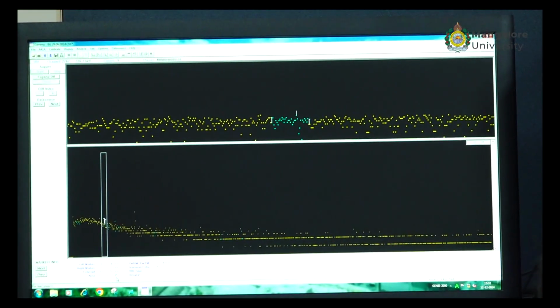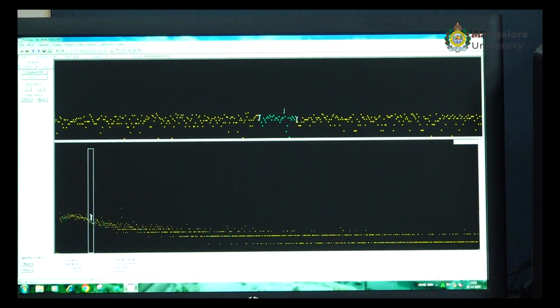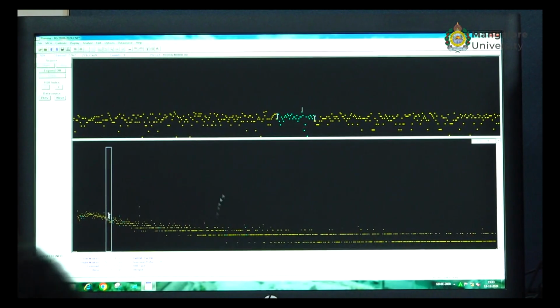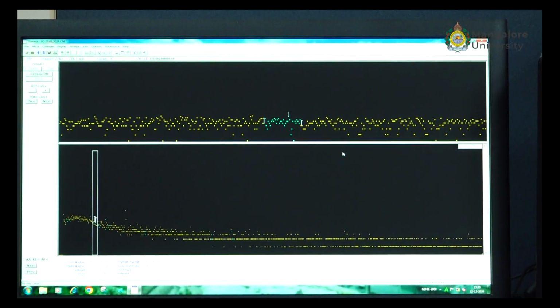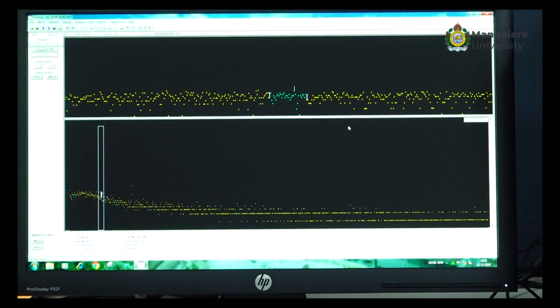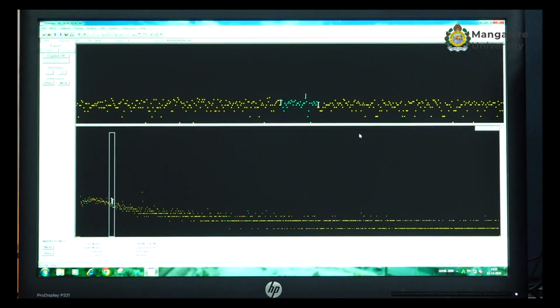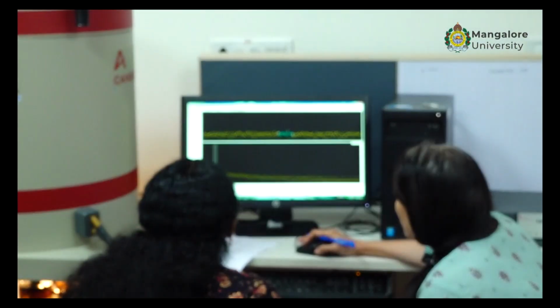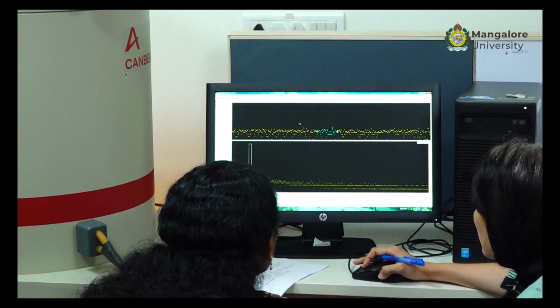No need actually, because first of all the counting time itself is very high. 1 or 2 counts down, 15 instead of 15, note down as 18, but actually since the counting time is very high, it doesn't matter, any change of 3-4 counts. But these are okay. You also don't have to correct the activity values because half-life is so much higher, more than 1 year.